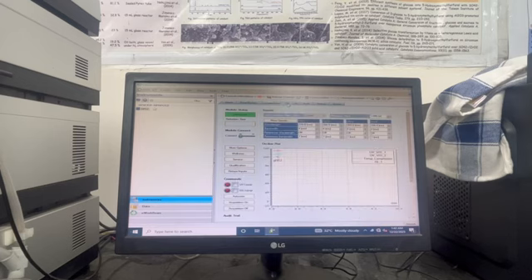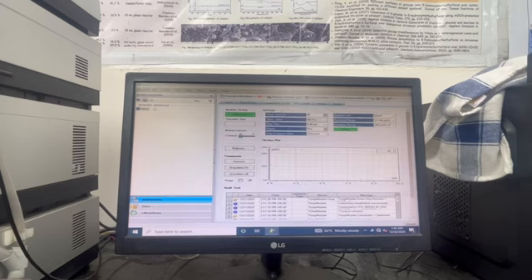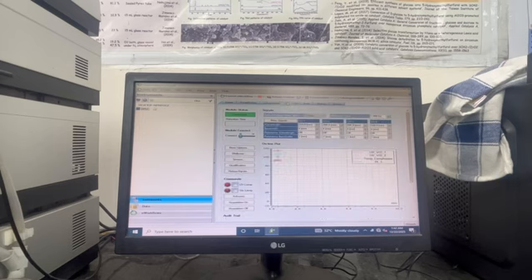Then like I said, RI should be ready. Most of the time RI takes time, so we don't turn it off, like I said. So this is what I mean. So this is now ready, it's green. So since it's green, we can click on the UVVs.